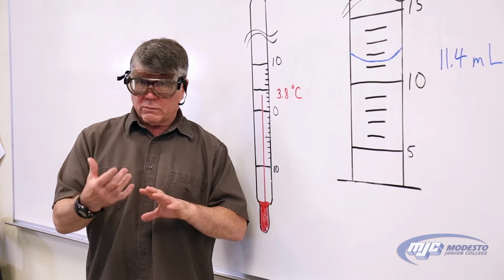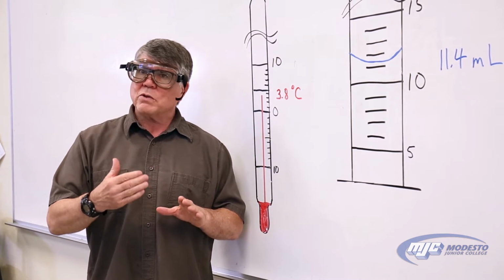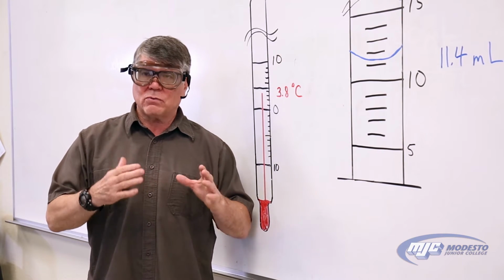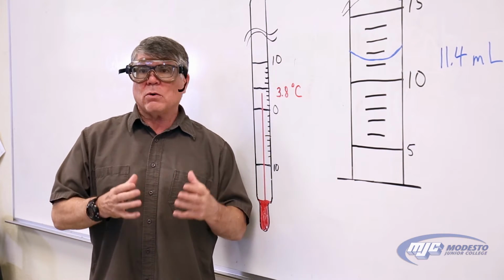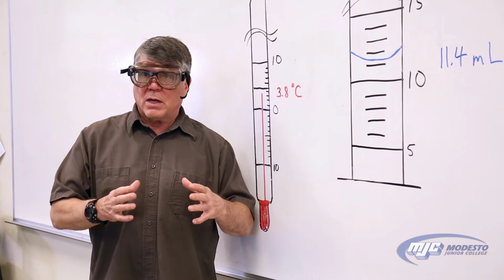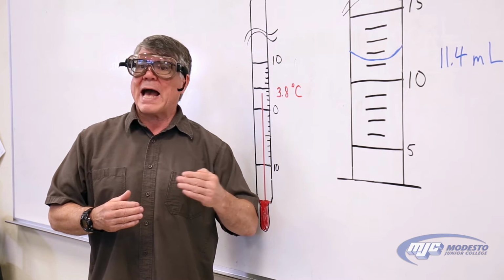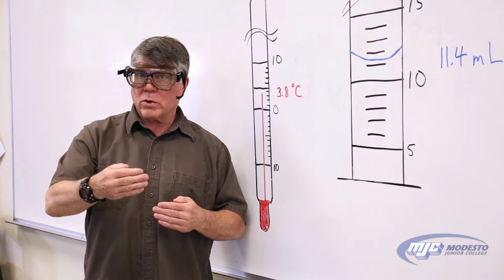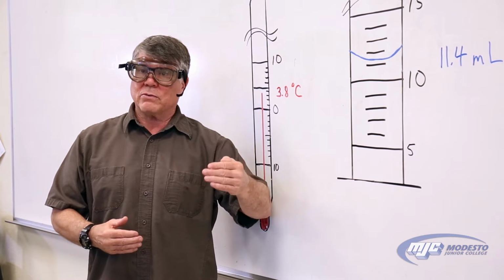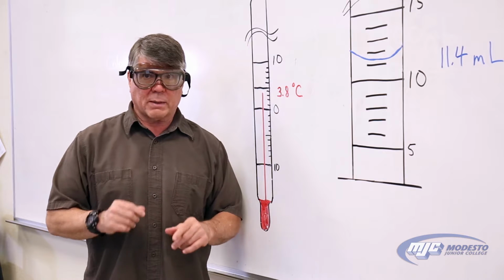And once we get those numbers, we're going to look at our measurements and see which was most accurate. Accurate means how close that measurement is to the real value. Now we know that ice water should be really just about 0 Celsius. And so the thermometer that's closest to 0 Celsius would be the most accurate. Likewise, for boiling water, the thermometer that measures a temperature closest to 100 degrees Celsius would be the most accurate. I'll talk about precision in a little bit in the second part.